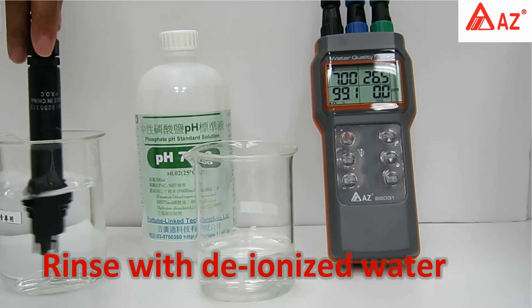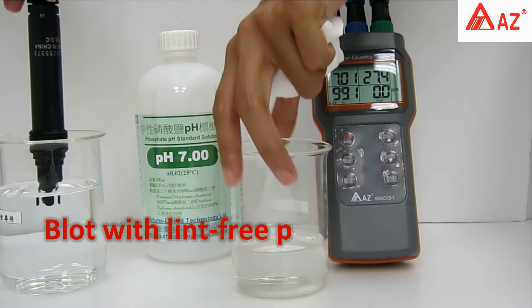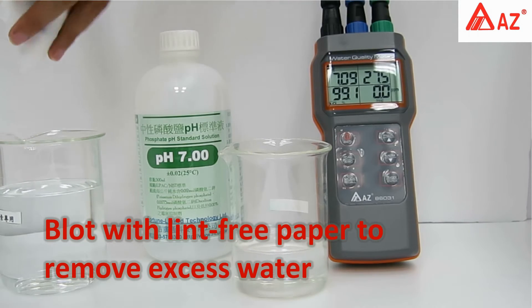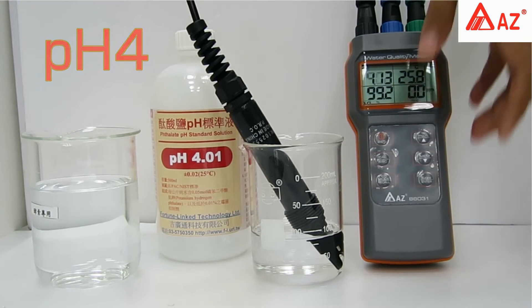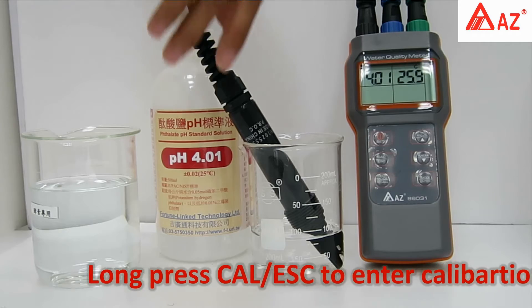Rinse the probe with deionized water when changing different solutions or after use. Carefully blot the bottom of the glass bulb with lint-free paper. For pH 4, press the Mode key to select probe type, then long press the Cal/Escape key to enter calibration.